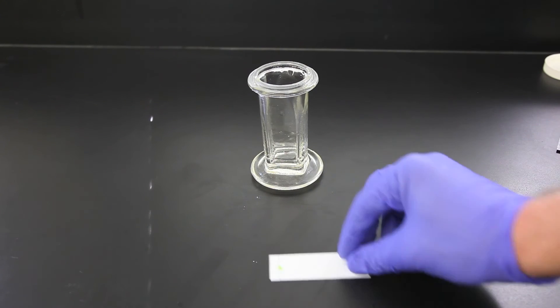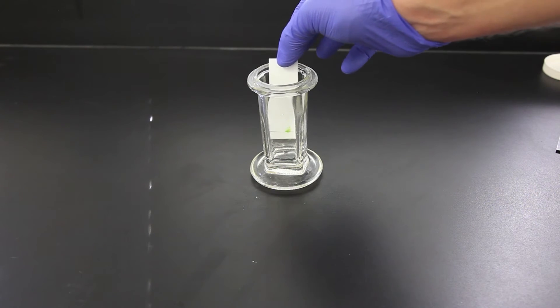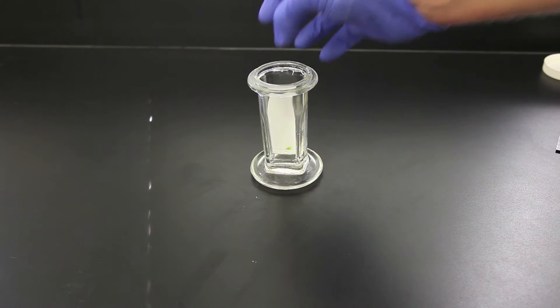Place the silica gel strip into the jar so the pigment spot is just above the solvent level. Close the lid and observe.